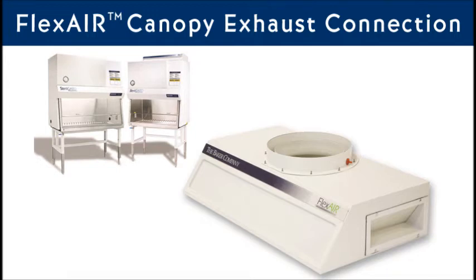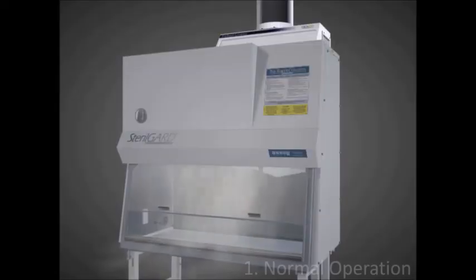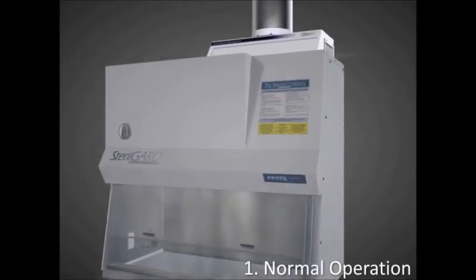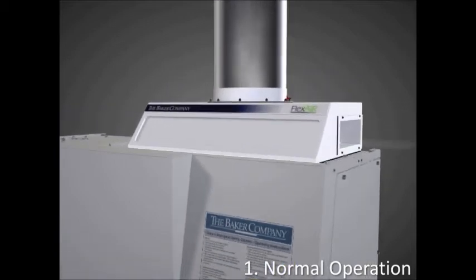The FlexAir canopy exhaust connection was designed to reduce the overall volume of air required during normal operation. It incorporates multiple openings covered by air dampers that can open and close as needed. During normal operation, less air is exhausted, which reduces energy requirements. The air dampers are entirely controlled by the air pressure naturally present in the system — no mechanical or electrical device is required.